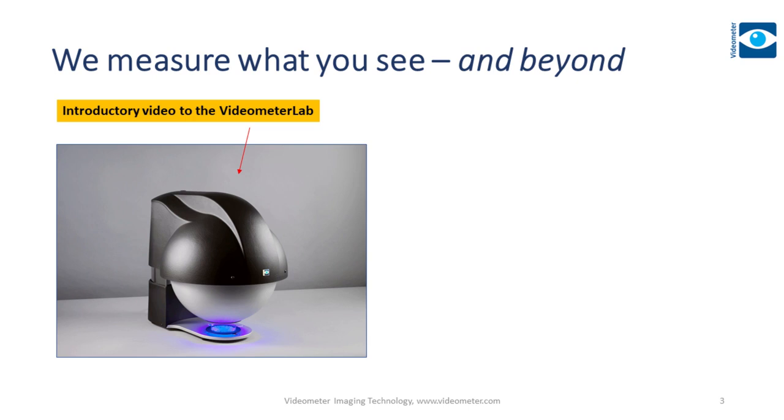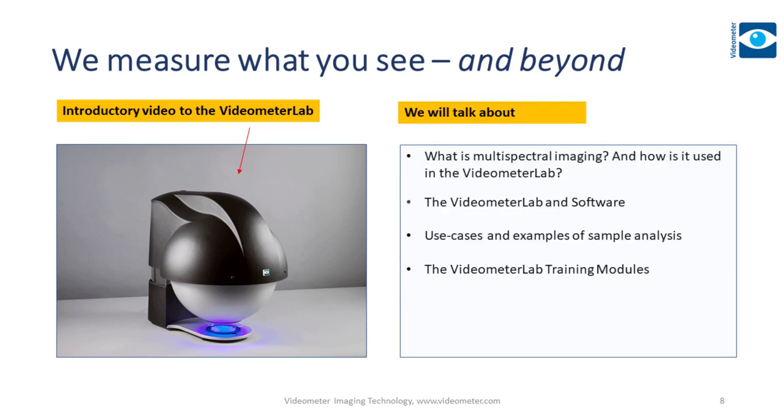And now to the $1 million question: what is multispectral imaging? And how does the Videometer Lab use these multispectral images to classify and quantify different samples and objects?